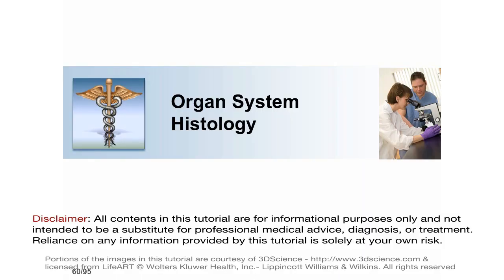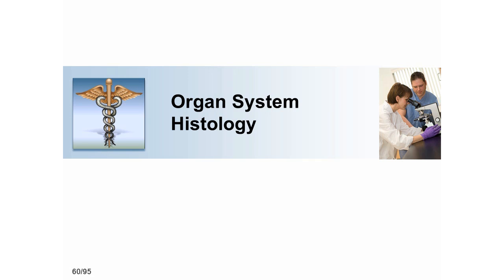For light microscopy, the basic reaction of stains follows the principle of the attraction of opposites. The acidic components of cells stain with a basic stain and are called basophilic, while the basic components of cells stain with an acidic stain.